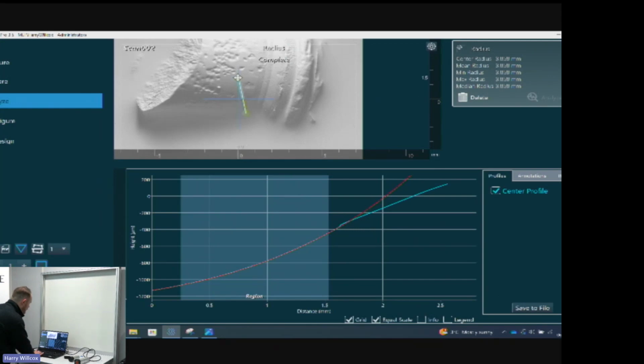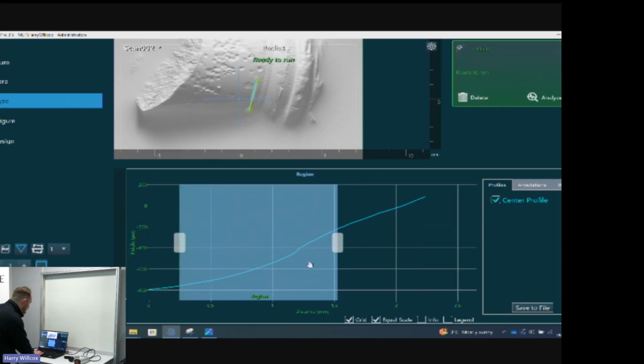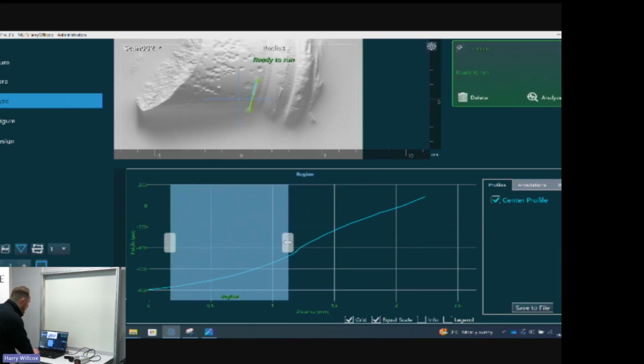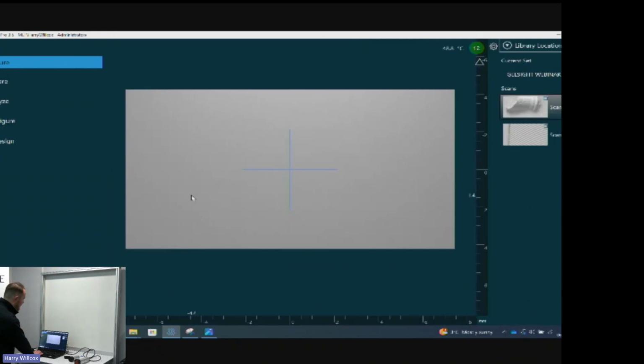So we would just need to revalidate the position where we've taken the measurement. And you can see that we're still able to measure. Okay, so that's the idea behind showing you the replica material, as well as the Gelsight Max and the use cases for the Gelsight Max with things like roughness and higher accuracy step changes.